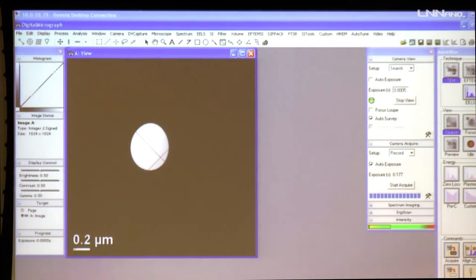One at a time, we have two knobs here, for X and Y direction. So I believe that that's good. It's oscillating exactly along the optic axis. So when you're happy with that, we can turn off the wobble effect. Now, after you finish the gun tilt, we can do the gun shift.